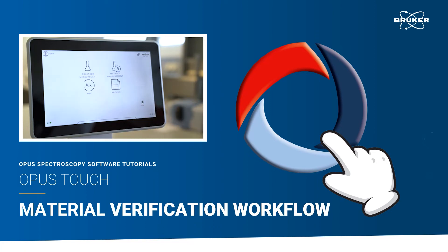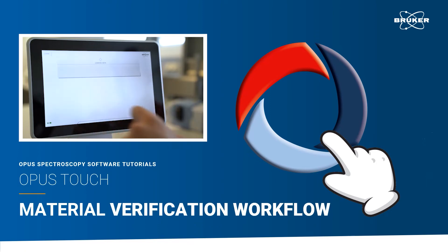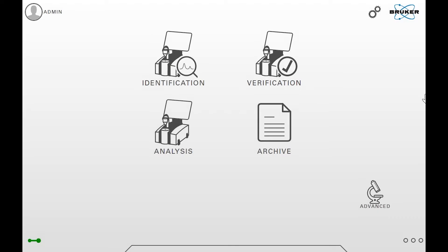Now you will learn how to use the verification workflow of Opus Touch. This workflow is intended for scenarios such as incoming goods inspection or quality control, where the identity of the sample is known and needs to be verified.